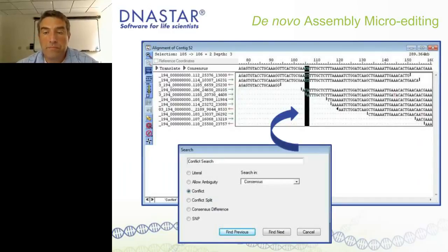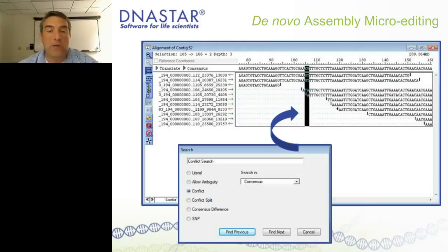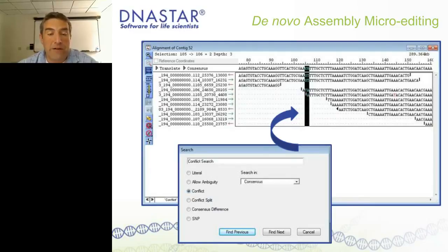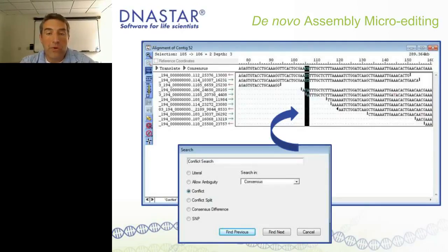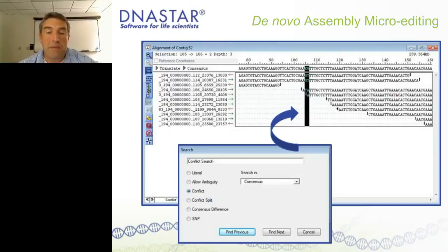Micro editing can be done in many different ways. There's a spot highlighted where there's an ambiguous place in the consensus. I use the search tool in our software to find conflicts or differences between the consensus and the aligned reads, using little chevrons in the window to move quickly to regions where there's a problem with the consensus call. I can go through the whole set of contigs, make micro edits, and type in what the correction might be, or flag regions where I need to get a Sanger run to confirm.